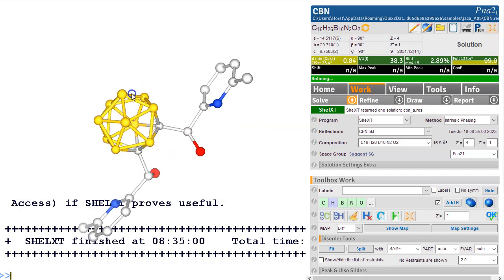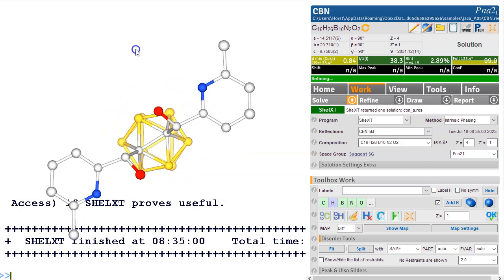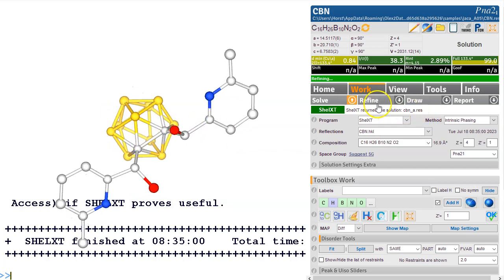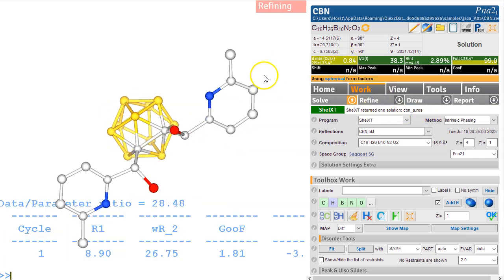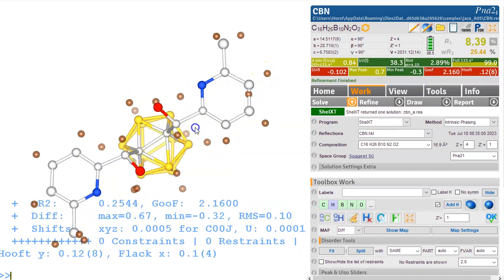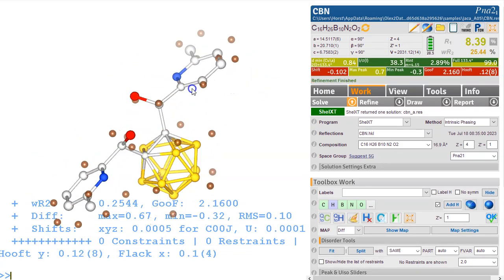So this looks like it's all done. We have got a boron cage here, we've got the carbons identified. And let's refine this and see what happens. Okay, so all the hydrogen atoms are quite clearly visible.